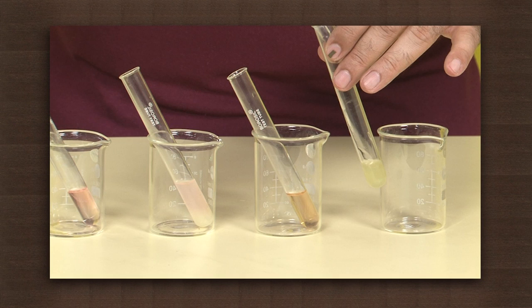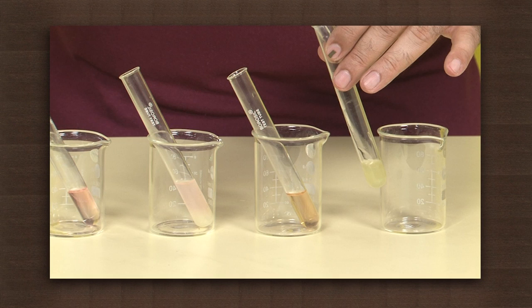Now add the china rose indicator drop by drop to soap solution. Wait for some time.